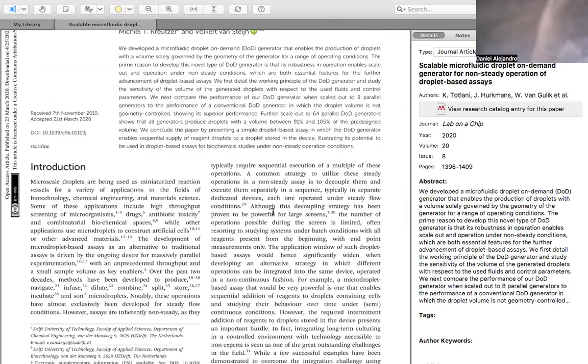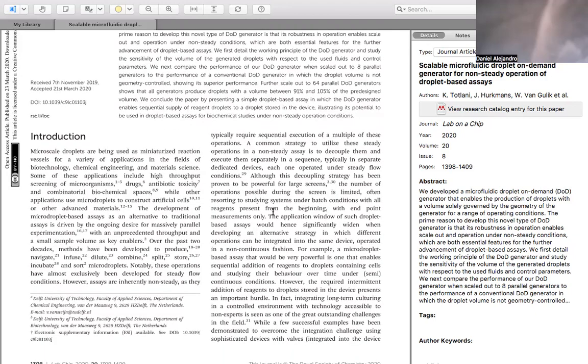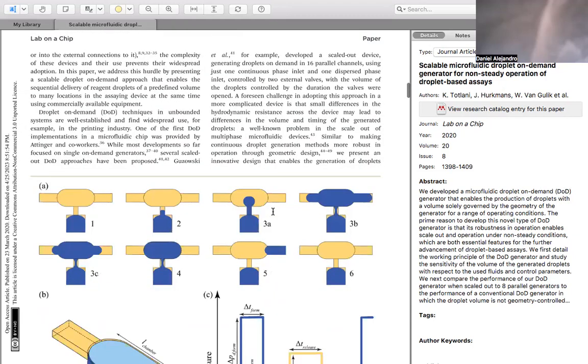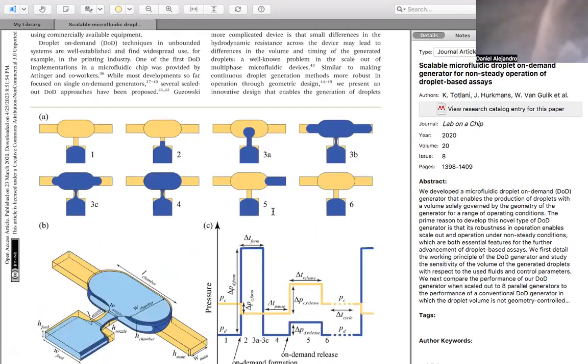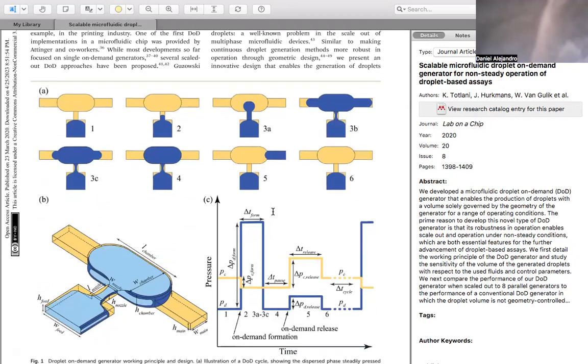Nowadays most laboratories want to obtain a lot of droplets on a large scale. In this paper, they show a new model to produce that. This new device basically uses a microchamber to produce the droplets.